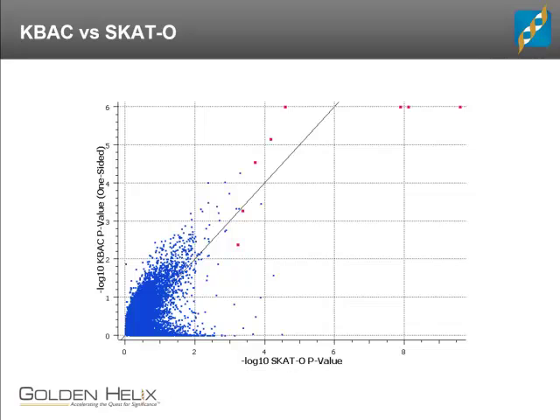But generally speaking, they both performed fairly similarly in identifying our genes of interest, even the genes that had less than 2% of all of the cases carrying a variant. In this case, where there wasn't too much noise in the variant data, it's still able to put those at the top of the list even if they're not reaching statistical significance.